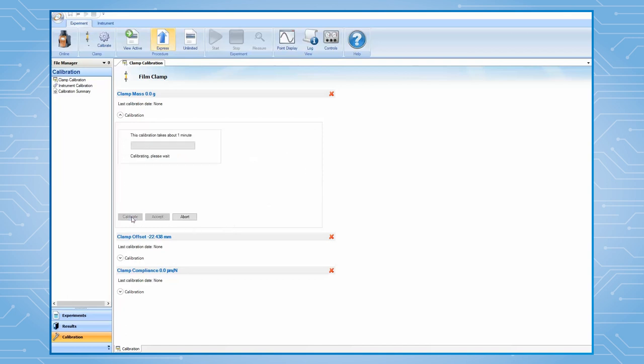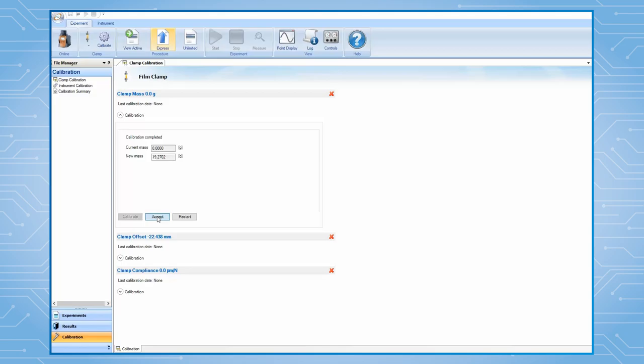This calibration is to measure the mass of the movable clamp. After it is finished, click on Accept.